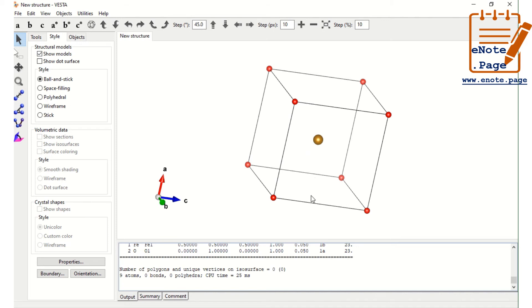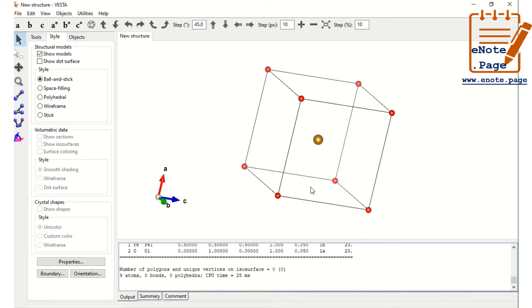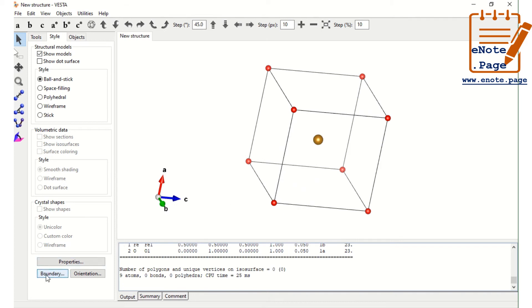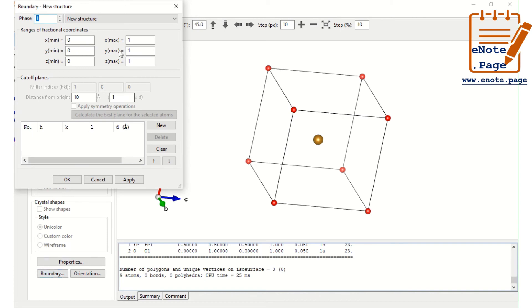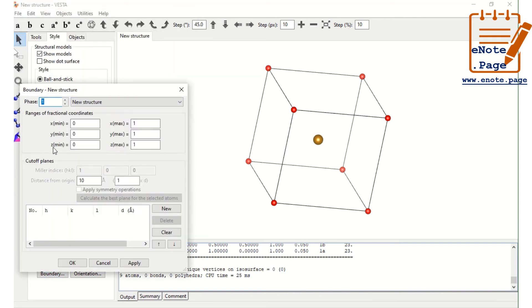Here you are having the Boundary option. Just click Boundary. Because we are having only one unit cell, we are going to expand it. Along the boundary, you can see x-minimum, y-minimum, z-minimum, and similarly x-maximum, y-maximum, z-maximum. Now we are having only one unit cell along each axis. Let us put x-max as 2, meaning 2 unit cells. Now apply.